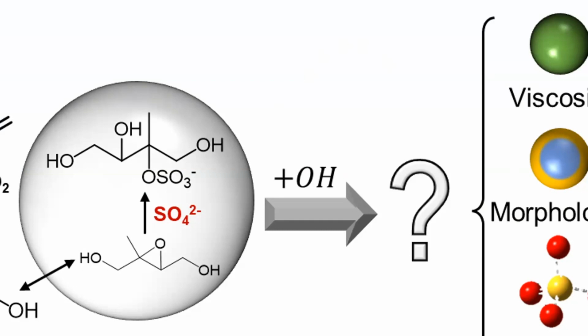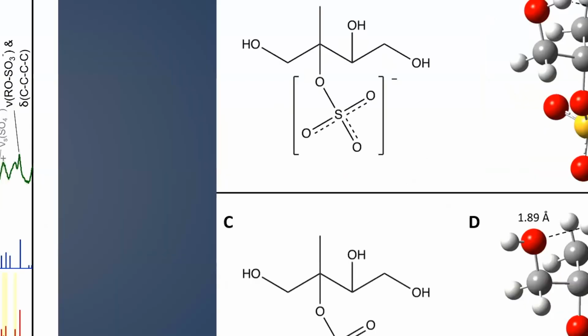So how does this tie into OPTIR? Well, one of the things that my collaborator is able to do is synthesize pure versions of these methyl tetrol sulfates that I just mentioned on the last slide. Those organosulfates have just been recently synthesized in the last 5 years. And so we wanted to, at a fundamental level, understand what they were made of.